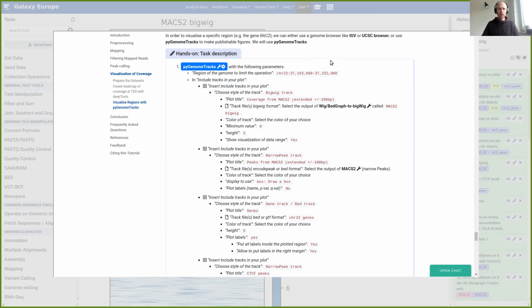So this is something which you typically do in ATAC-Seq, of course, to see what kind of regulatory elements you have in your data and how do they correspond to certain transcription factors, transcription subsets, and which are kind of novel and maybe of interest for further analysis.